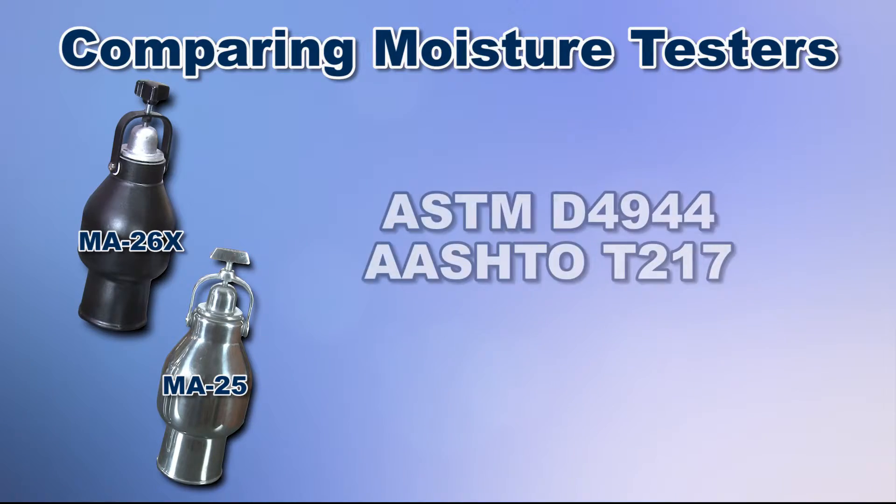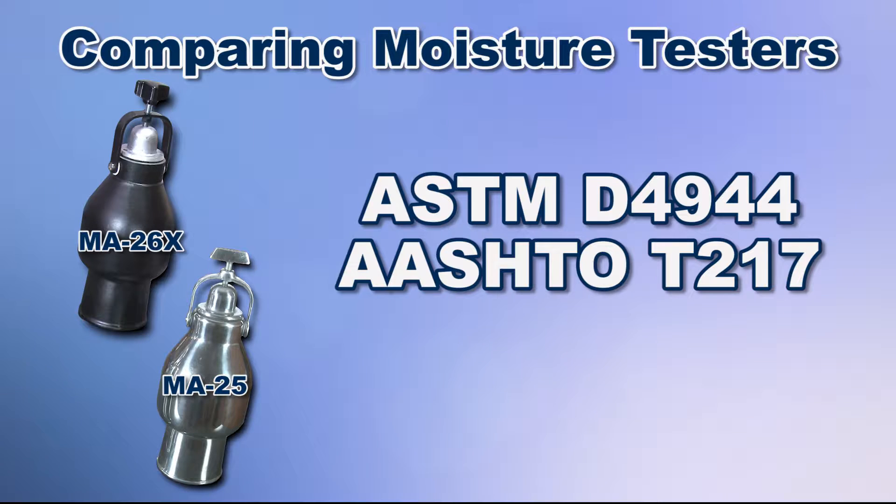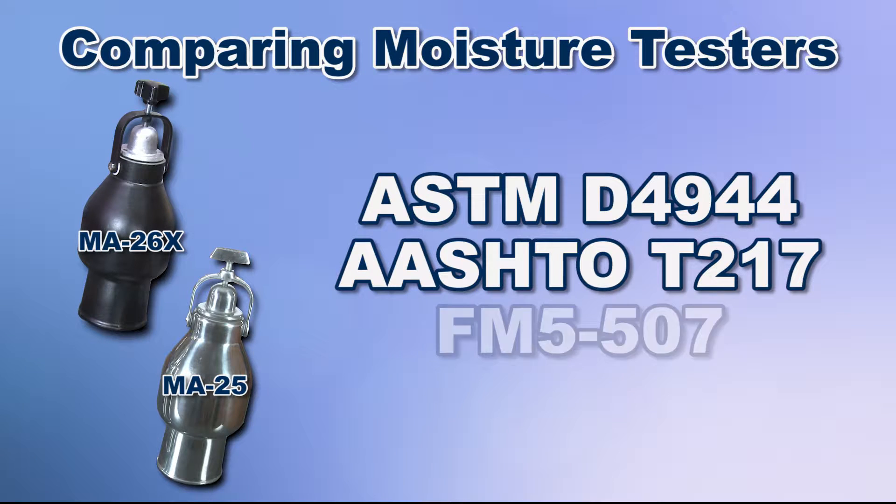Both units meet ASTM D4944 and AASHTO T217 standards, as well as the Florida Department of Transportation FM5-507 requirements.